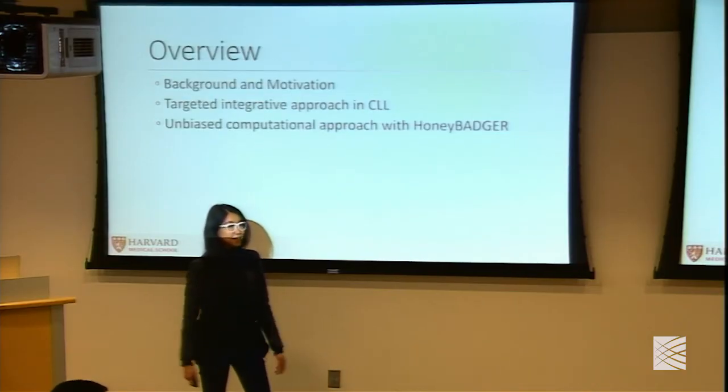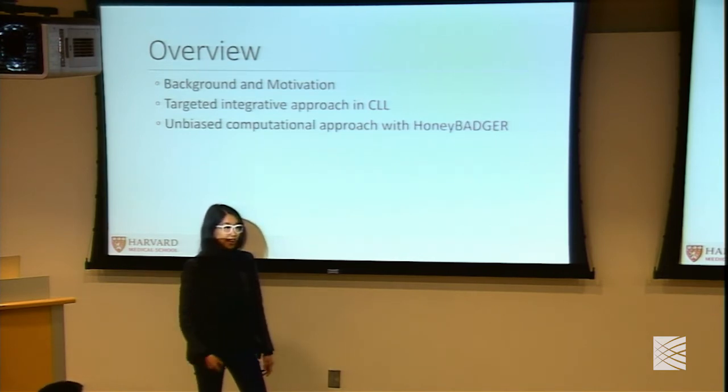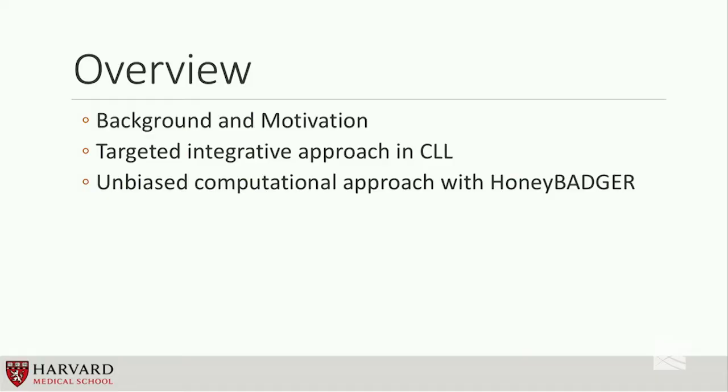So just as an overview of my talk, I'll first give a very brief background and motivation for why to take a single-cell approach at this. No doubt I'm kind of preaching to the choir here. But then I'll talk about our work with a targeted integrative approach for dissecting how genetic and transcriptional heterogeneity are interlinked in chronic lymphocytic leukemia. And lastly, I'll talk about an unbiased computational approach with a software called Honey Badger that I've been developing in the lab.